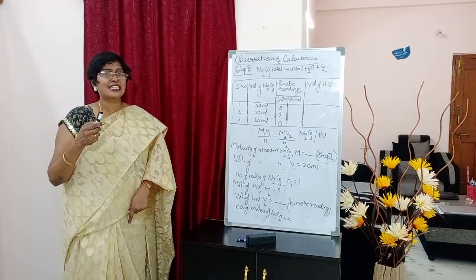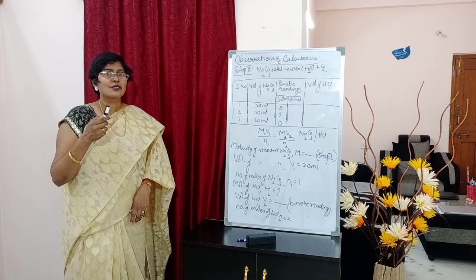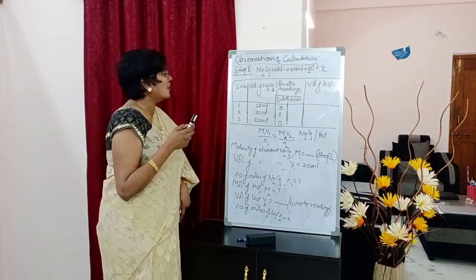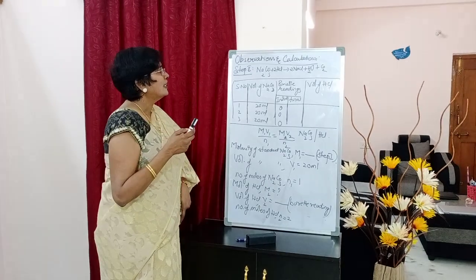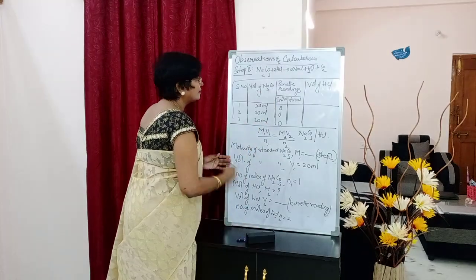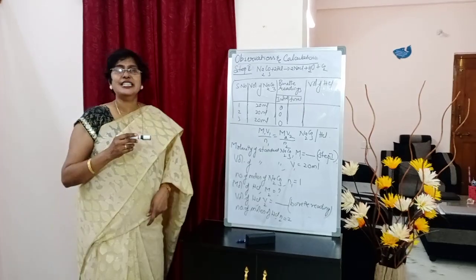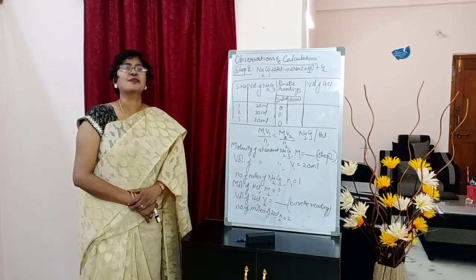Draw neatly with a scale and pencil. Don't draw as you like. Okay. So observation. It should be maintained neatly, students. So first column, serial number. Next, volume of Na2CO3. Next, burette readings. Under burette readings, again divide into two columns. Initial, final. Final column, volume of HCl.